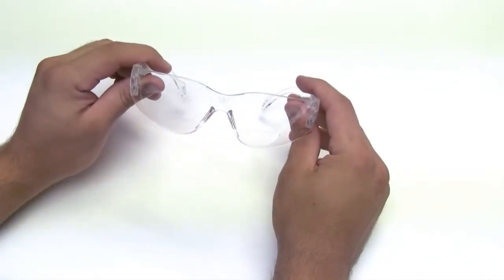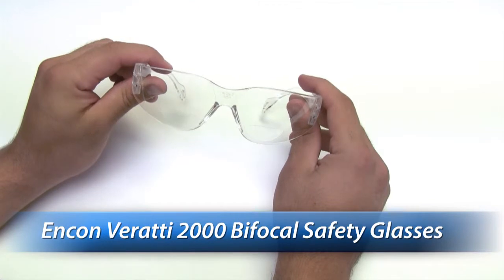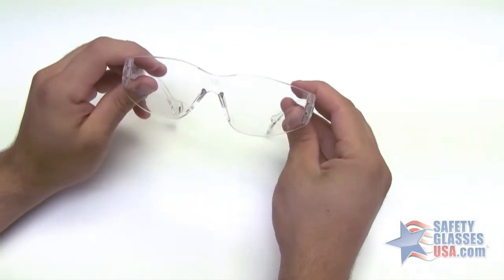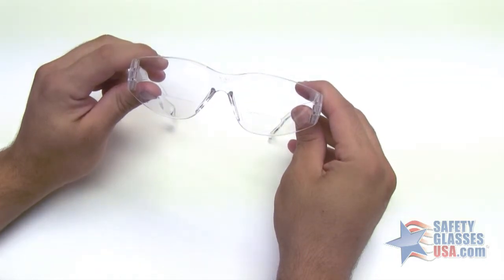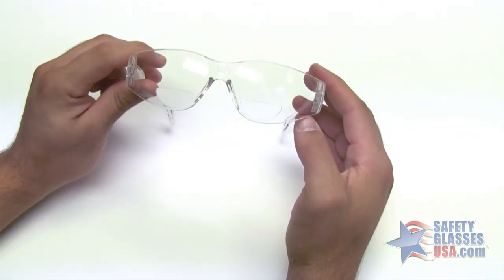Hi, this is Mark with SafetyGlassesUSA.com, and I'm going to talk about the Incon Verratti 2000. These are the Incon Verratti 2000 bifocal safety glasses with the clear lens. The Verratti 2000 is available in diopters of 1.0, 1.5, 2.0, 2.5, and 3.0, and in a gray or indoor-outdoor lens.